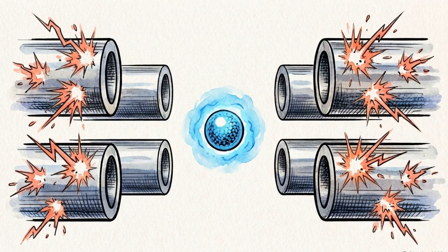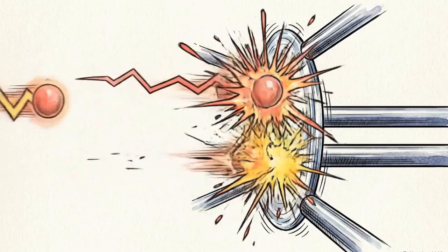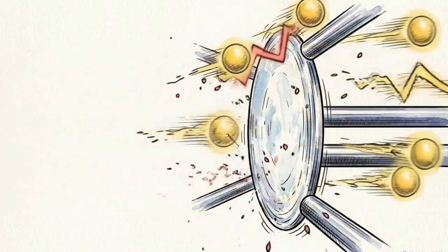Because the quadrupole relies on spatial filtration rather than perfect timing, its pressure tolerance makes it the perfect analyzer to bolt directly onto the back of a continuous flow gas chromatographer. The quadrupole sacrifices extreme mass range for rugged, continuous spatial filtration, acting as an uncompromising electrodynamic bouncer for volatile chemistry.